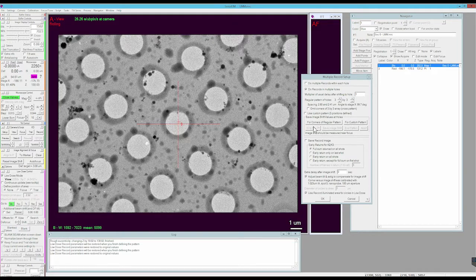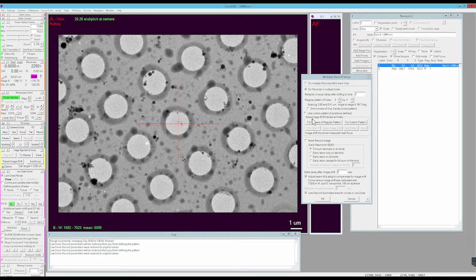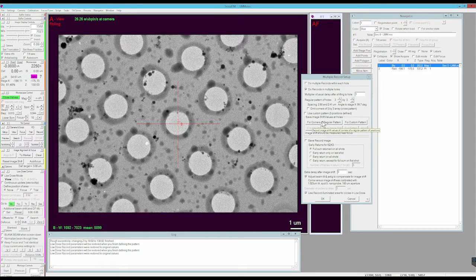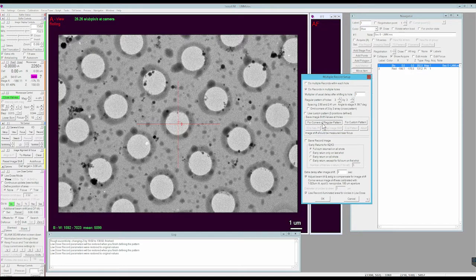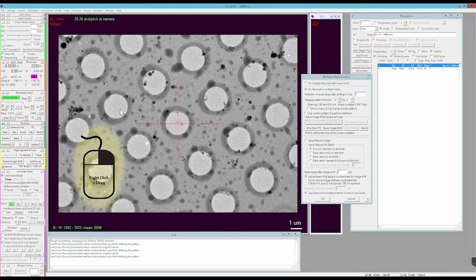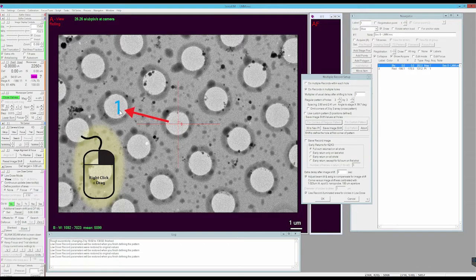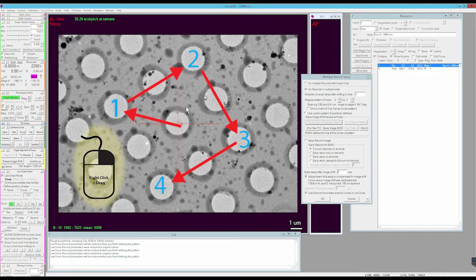To set the 3x3 pattern for our specific grid, we use this dialog here, Save Image, Shift Values at Holes. I'll click the top button for Corners of Regular Pattern. With that selected, I'm going to do Image Shifts to each of the corners of this 3x3 pattern.